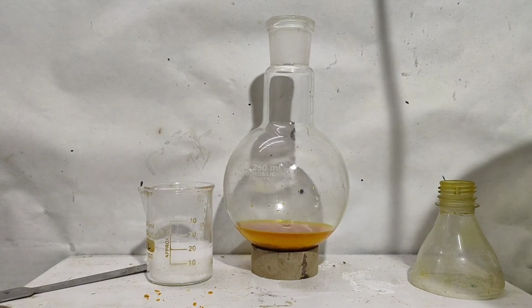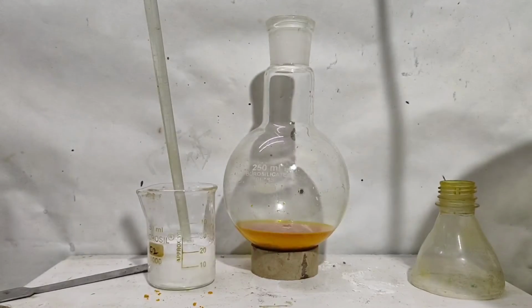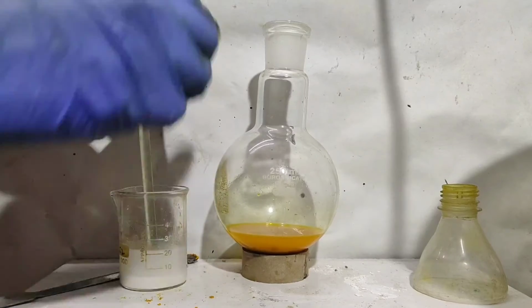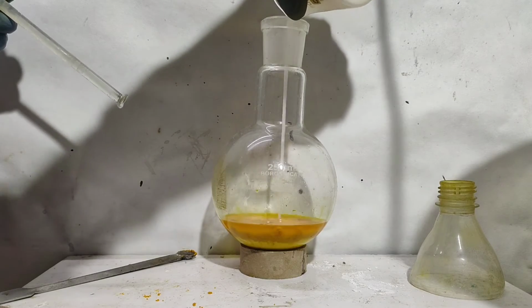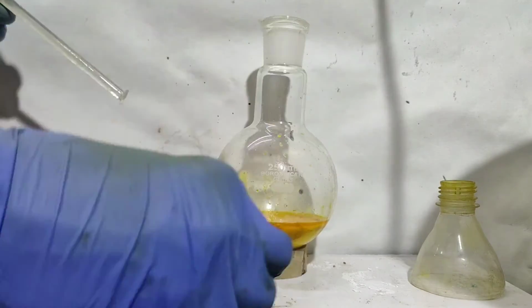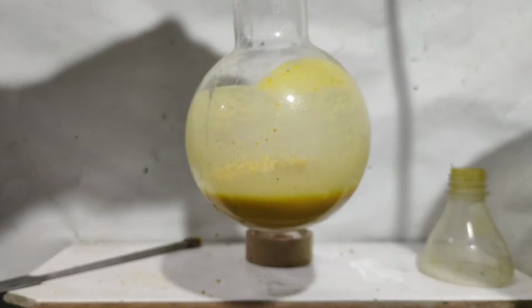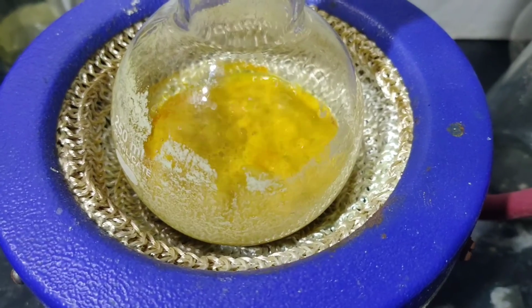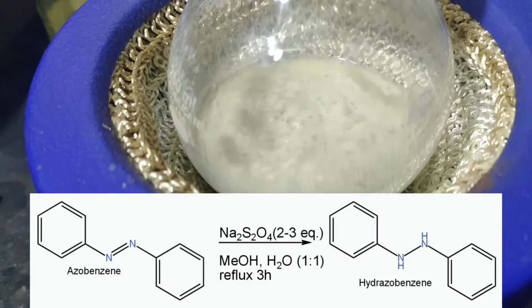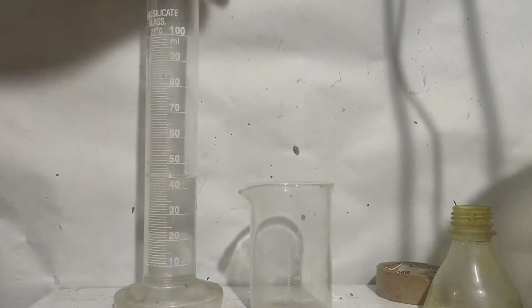It started bubbling, so I added some sodium hydroxide to increase the pH and stabilize it. Sodium dithionite did not dissolve completely, so I added it as a slurry and transferred the remaining solid with some distilled water. Then it was set on reflux. After 3 hours, the reaction mixture turned white. So before transferring the white PPT into a funnel, I prepared dilute HCl.